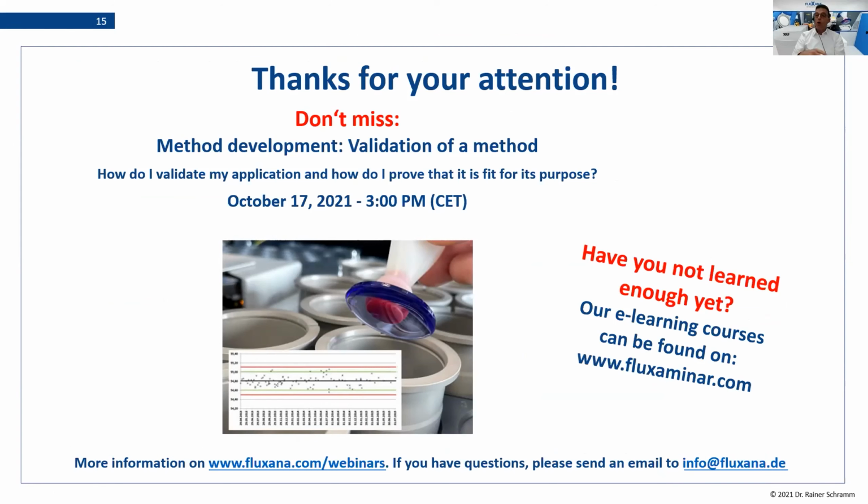In the calibration curve is of course the same information that I have shown you when you measure a blank value. Calibration samples which are very close to the limit of detection have, of course, the same distribution as a blank value. So if you take the calibration at the very low end, you will find in the standard deviation the same distribution as in the standard deviation of your blank value. And in this way, you can easily also calculate this value from the calibration curve.